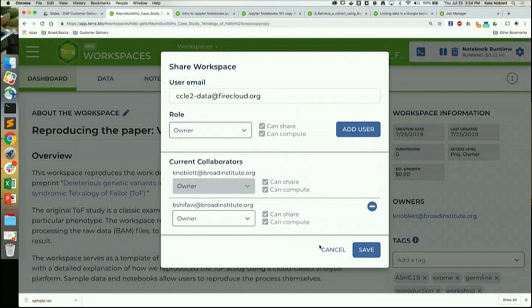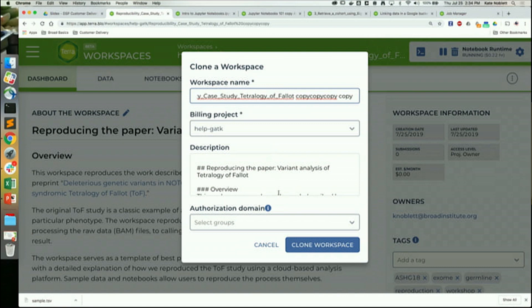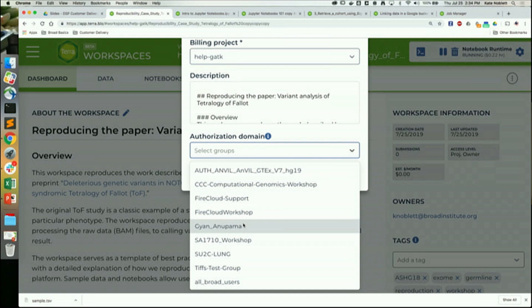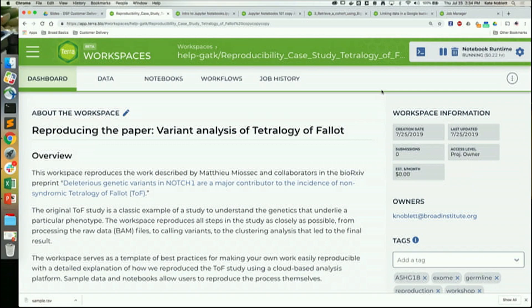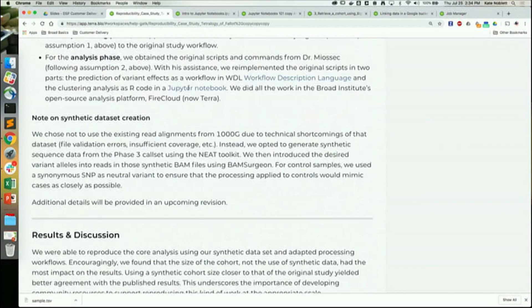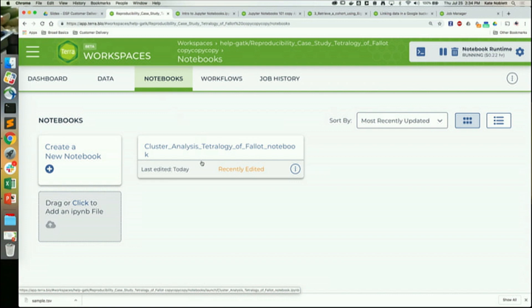You can add lots of users one by one, but if you want to share with a large group from the get-go, that's when you would use the authorization domain. If you're already on Terra and you already have a group — an authorization domain — where all the users for that project are already there, you can add them when cloning and they'll all automatically be included.